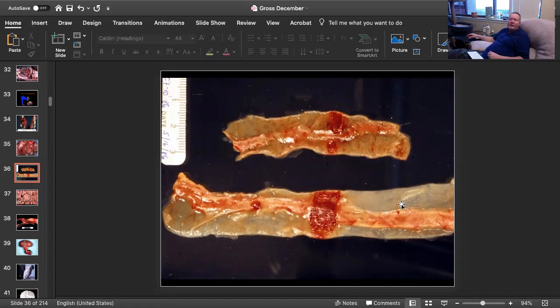Eventually, this duck is going to get a very severe enteritis, and it actually may have that. This may be a fibrinous cast right here, and we're just not seeing a tremendous amount of hemorrhage and necrosis. This is a little more roughened. So fibrinous cast and this very characteristic necrosis of Peyer's patches. My morphologic diagnosis will be focally extensive necrosis and hemorrhage of intestinal Peyer's patches.